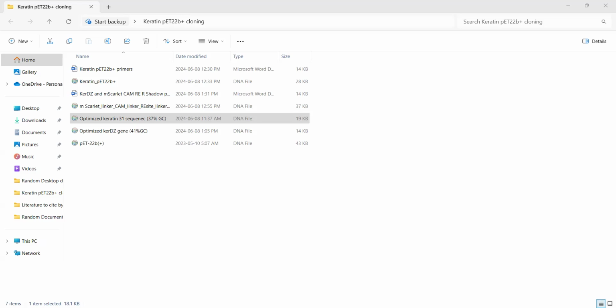So what we will do here is literally cutting out everything up to here. So we want to leave the space for keratin. So our forward primer in this case will bind here. So this is forward primer, and you have to play with this, but I know because we were doing it on Saturday.